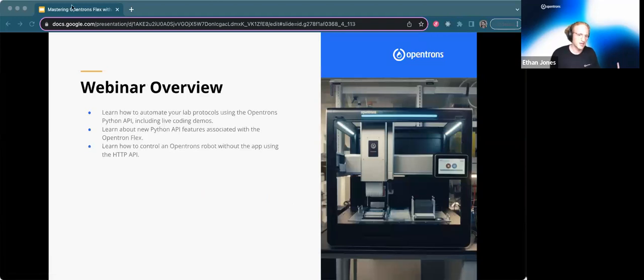And today's webinar, we're really going to learn how we can use both the Python API and HTTP API to their full potential to control the Opentrons Flex.